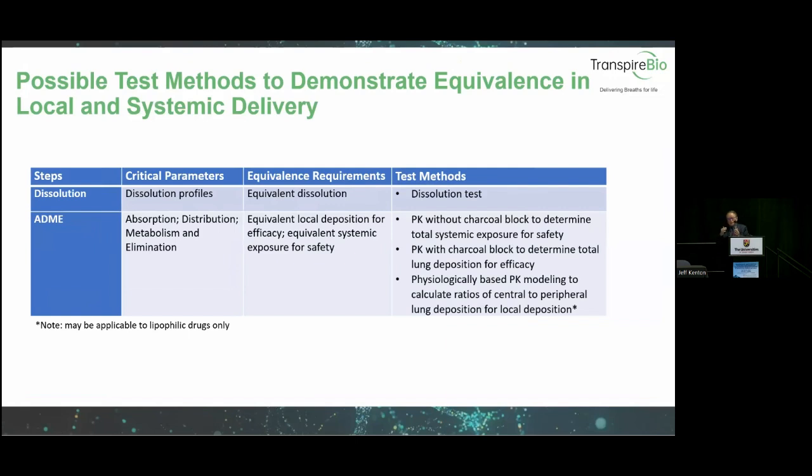So once we have achieved that, of course, then we need to demonstrate, after deposition, dissolution and then ADME. For the dissolution test, a lot of work has been done. For example, Gunther's group has done a lot of very good work on dissolution tests, which is very relevant for DPI or for solution suspension. It could even be relevant for solution aerosol.